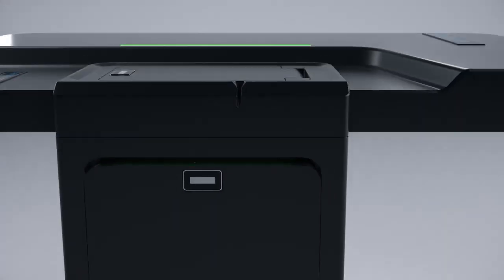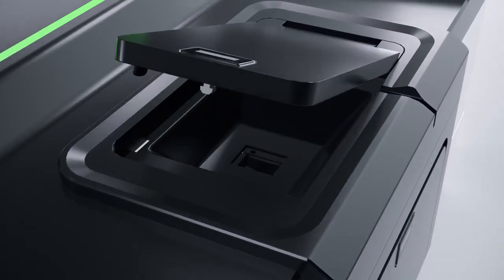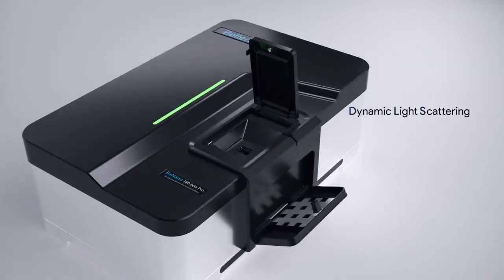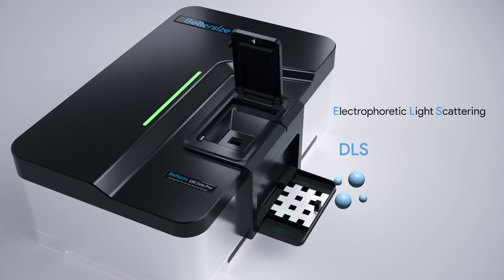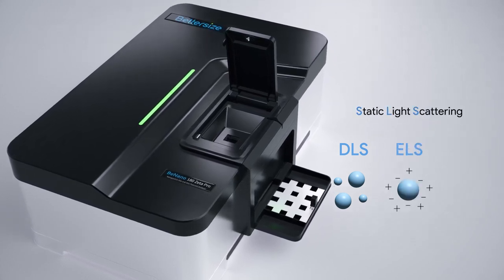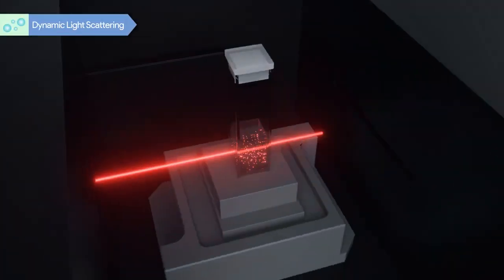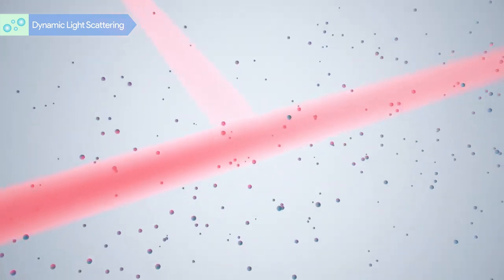Introducing the BeNano series, an advanced analyzer that combines 3 novel light scattering technologies for precise nanoparticle analysis. Dynamic light scattering for particle size measurement, electrophoretic light scattering for zeta potential measurement, and static light scattering for molecular weight measurement.